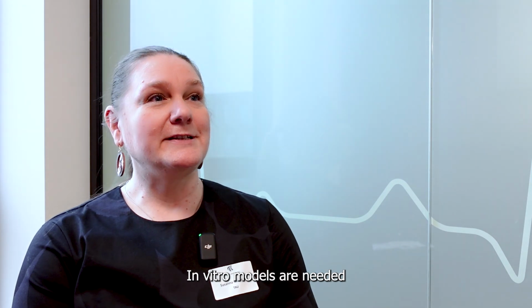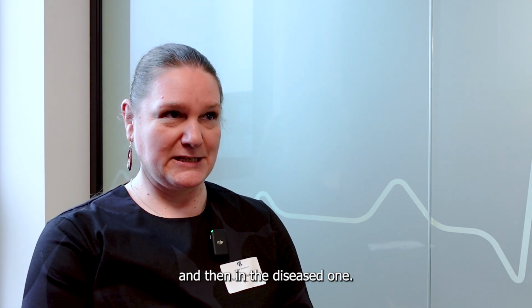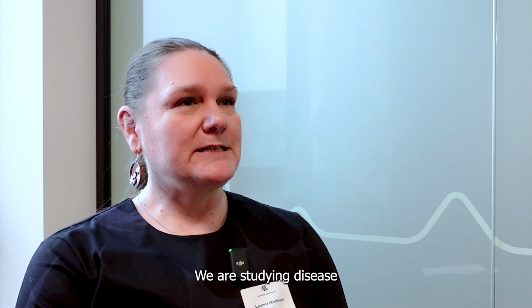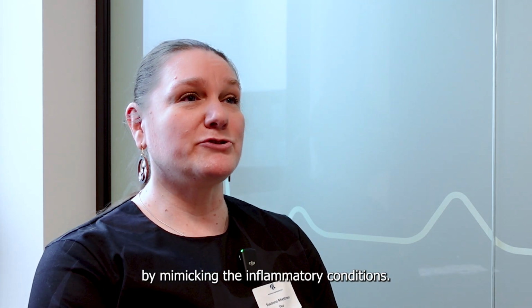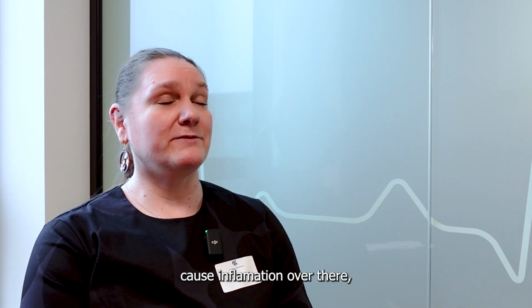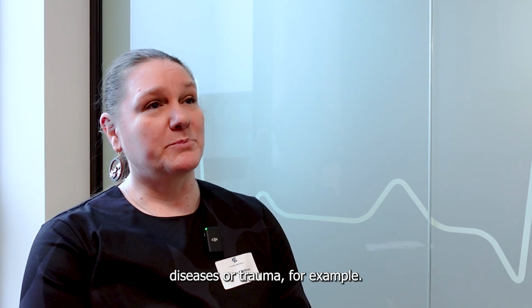In vitro models are needed because we want to study cellular interactions in the urethra, first of all in the normal urethra and then in the diseased one. We are studying diseased conditions in urethra by mimicking the inflammatory conditions, since several reasons might cause inflammation over there, diseases or trauma, for example.